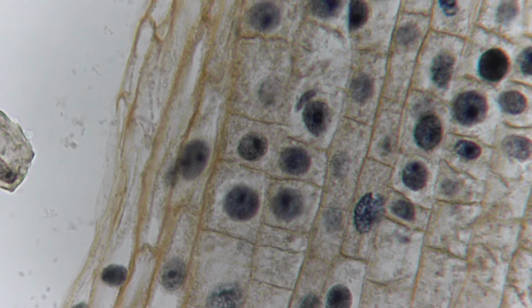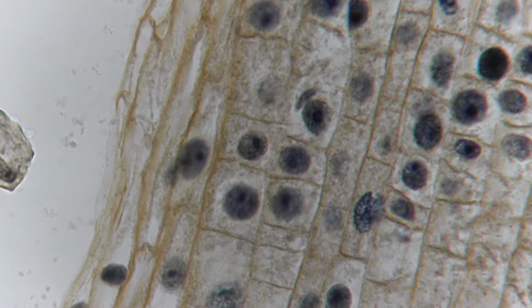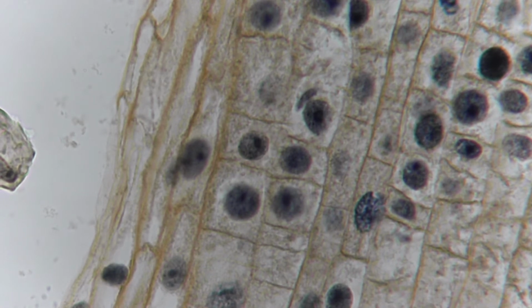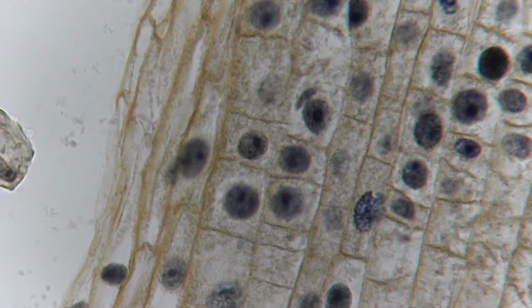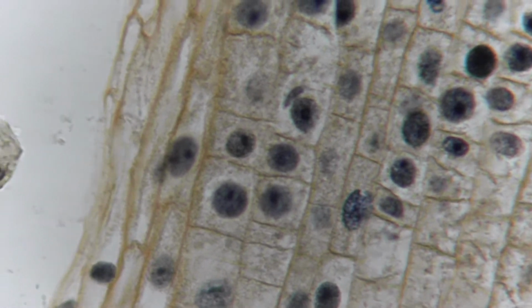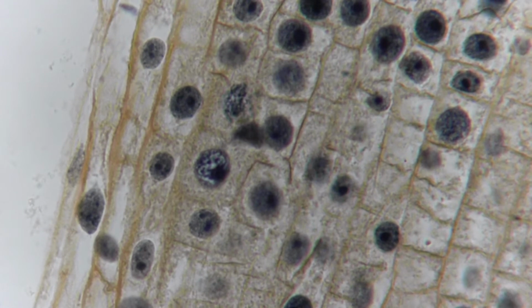Now I kind of mapped these so I won't spend a lot of time. And I drew me a little map here, and I think I can go and find these phases in order. So I'm going to go up and down and show you a prophase. Remember, in prophase, the chromosomes look like a pile of worms. So maybe it won't make you dizzy. I'll go slow here. And I'm going to go down and find a prophase, and I'll point it out when I get there, and then I'll put it in the center of the screen.